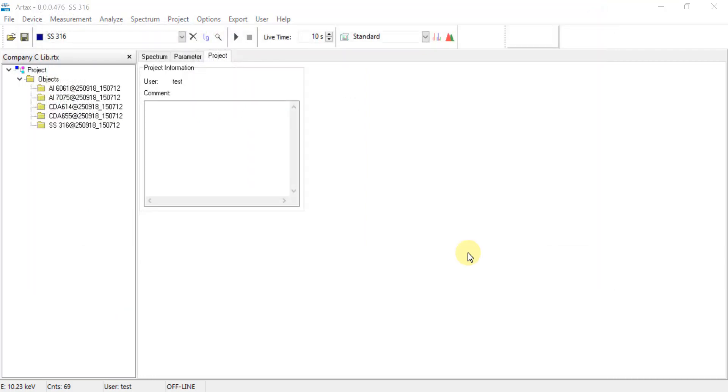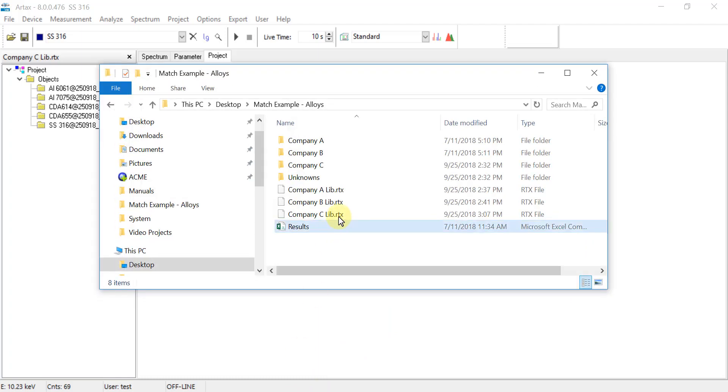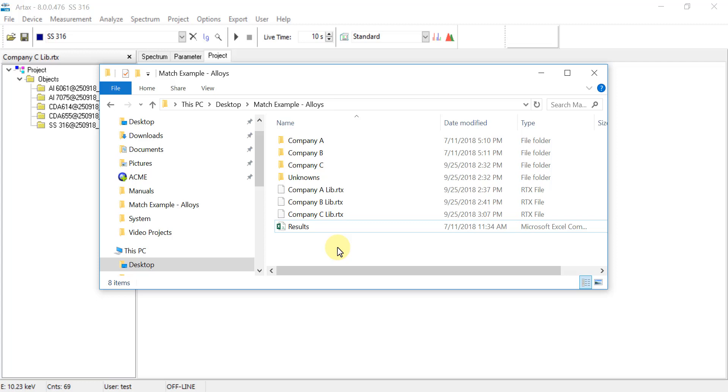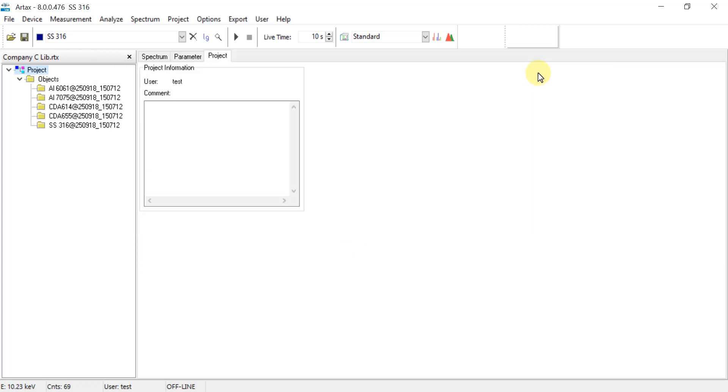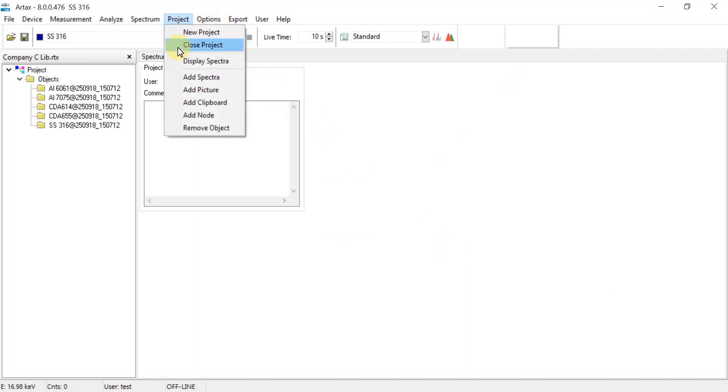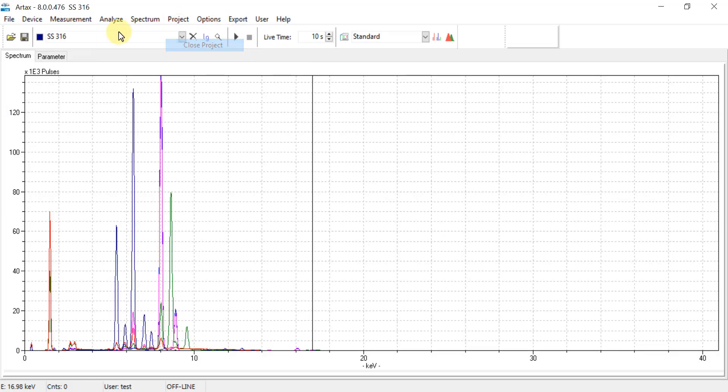When a match is performed it will search through all libraries in a given folder. For this example I have been storing all libraries in a single folder location so that when a match is performed it will search through all libraries for company A, B, and C at the same time. The other option is to store each RTX file in its respective group folder so that when performing a search the user will then select which individual library to search from.